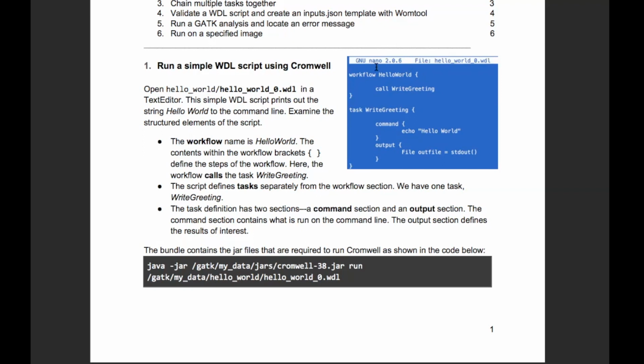All right. So if you were all able to run this, I will show you how you can use the inputs. But just before that, if you scroll up in your standard out, you will see this section called outputs. When you run the WDL, you get this standard out.